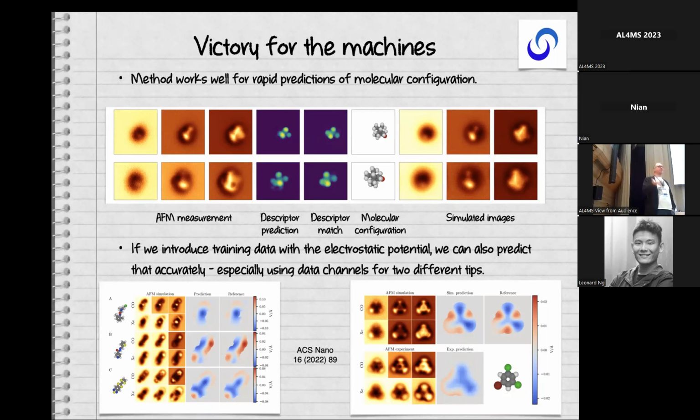And again, this is very nice. If you have images of a big biomolecule, and you're interested in where the functional groups are, where the dipoles are, you can get a really fast prediction, in seconds on a laptop, of the electrostatic potential that you could trust to a reasonable degree.